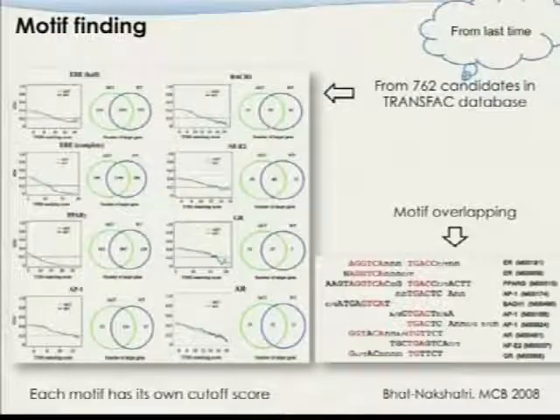This is one of the examples from a paper we published, in which we used ChIP at that time, around 2007, and identified the estrogen receptor alpha binding sites using a ChIP experiment. We found thousands of different regions and searched for motif enrichment in those regions. As you can see, these are the factors that eventually showed significant enrichment, with the bar at about 20% FDR, and these are the different motifs. Here are the real motifs, and you can see the sequence similarities in these regions.